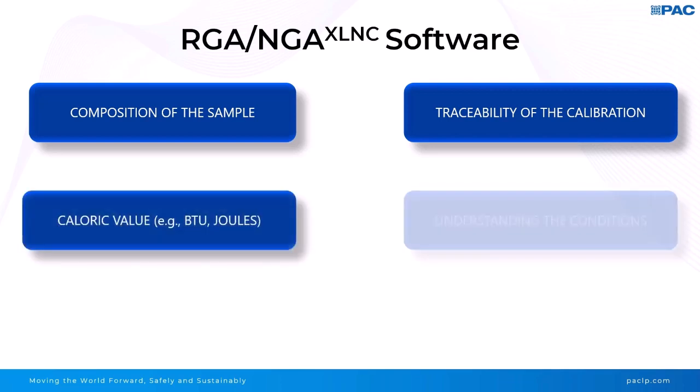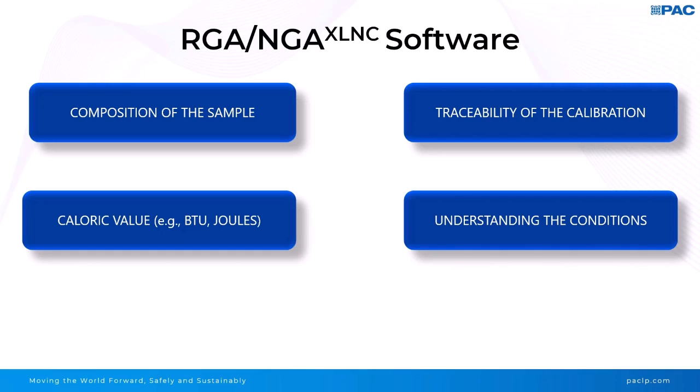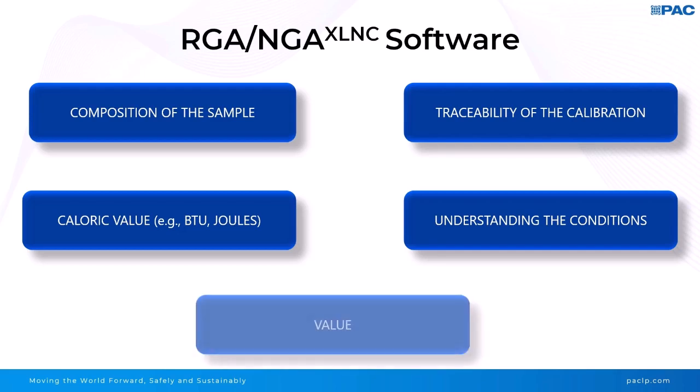The software, of course, should be able to calculate the physical properties of a gas, like the calorific value, Wobbe index, specific gravity, etc. And in addition, that it is calculated by the desired method, at the metering conditions desired, and of course that it is reported in the unit desired, like megajoule per cubic meter or BTU per cubic feet. All of this adds value for the operation of the gas analyzer in the lab, but also literally for the gas analyzed. Knowing the energy content, calculated from the composition of a gas, has a monetized value.